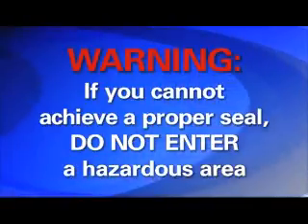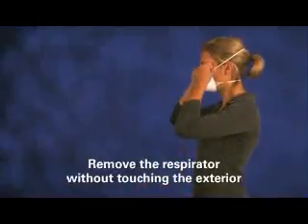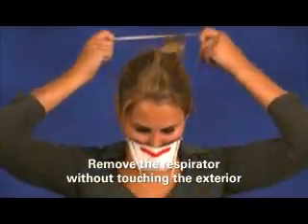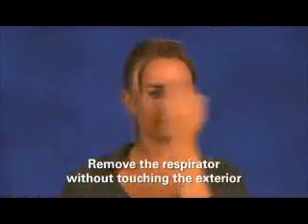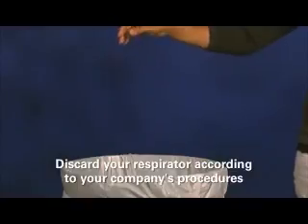If you cannot achieve a proper seal, you are not protected and should not enter a hazardous area. See your supervisor to determine what the problem may be. When you're finished wearing the respirator, carefully remove it without touching the exterior, because the exterior may be contaminated. Discard your respirator according to your company's procedures.